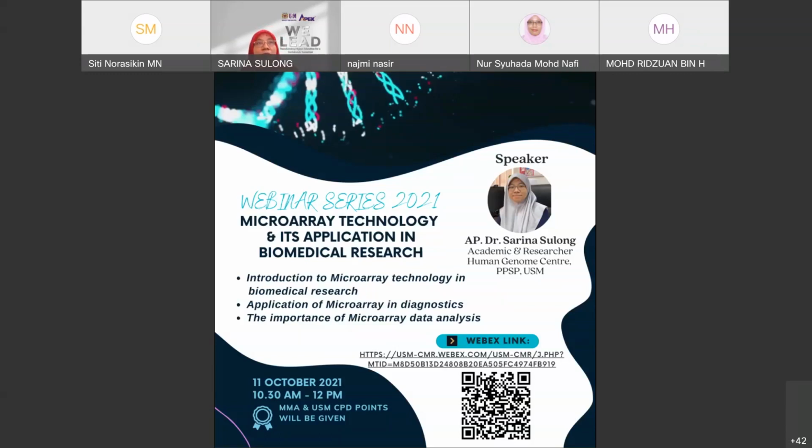And what else? The limitations, of course, I would say the cost. It's quite expensive if you want to apply it as a diagnostic method. For research, it's also quite difficult to get grants if you want to apply for like 300K or 400K, because the cost of DNA microarray analysis is quite expensive if you want to use a number of samples. Normally we start with a few samples first with the DNA microarray applications, but it depends on the budget as well.